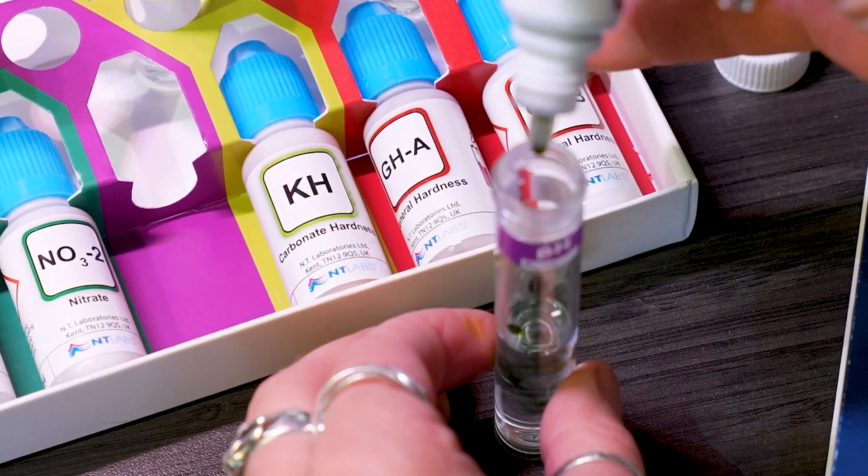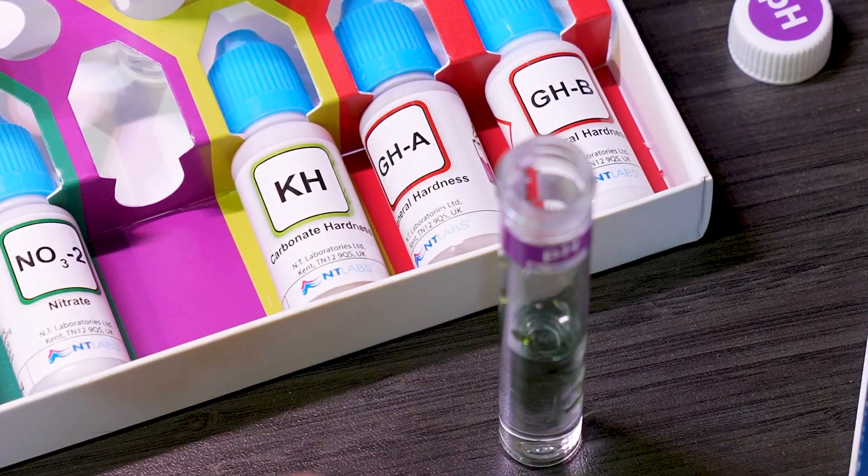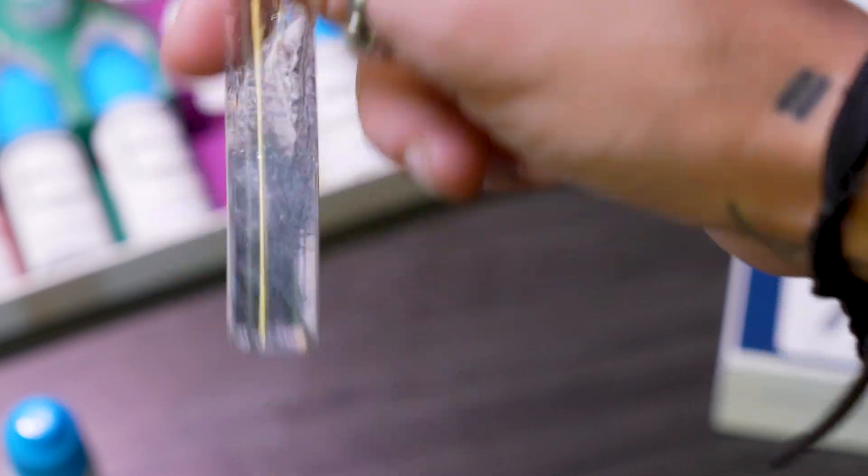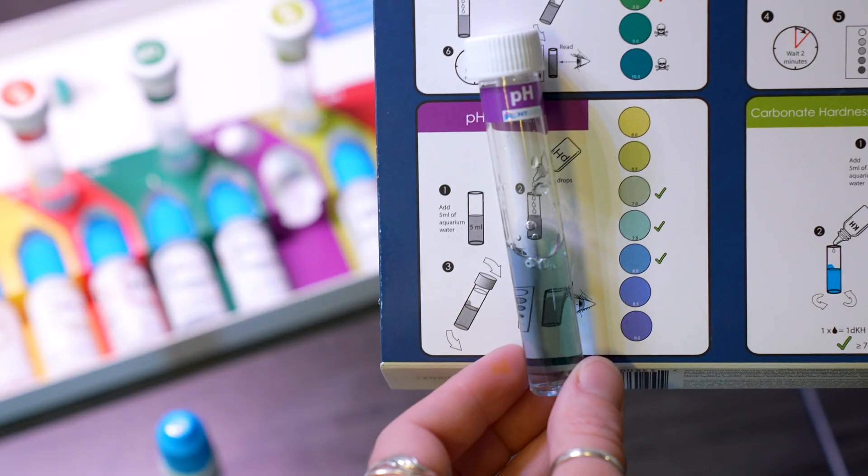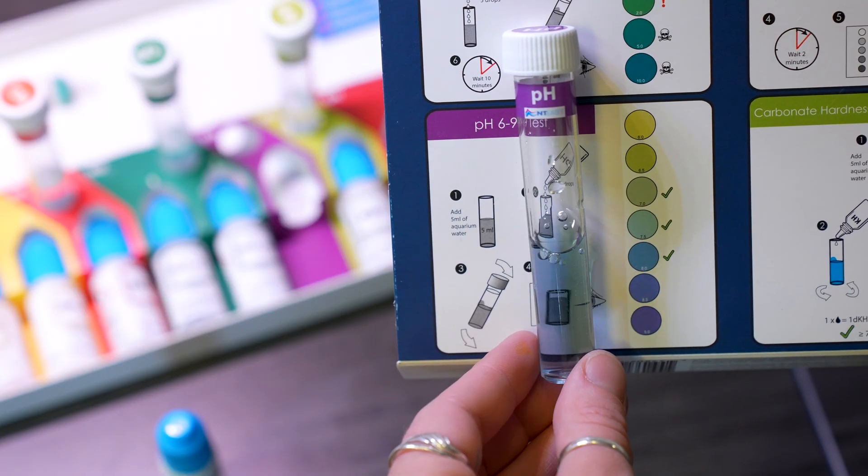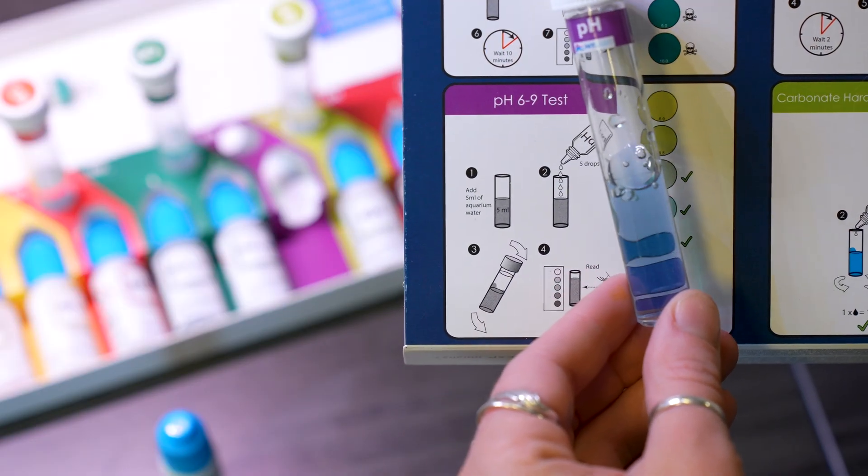I'm putting in five drops of the reagent. I'm then just going to give it a bit of a swirl, or in this case, shake. And then simply compare it with the color-coded graphic here to find your levels. It looks like I'm sitting right in the range where I want to be.